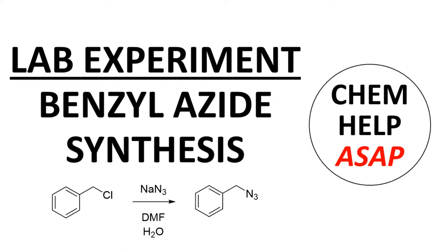This is one of the great SN2 reactions and just about impossible to mess up. This reaction uses sodium azide, which can have some toxicity, and forms a large amount of an alkyl azide, which can have its own safety issues.